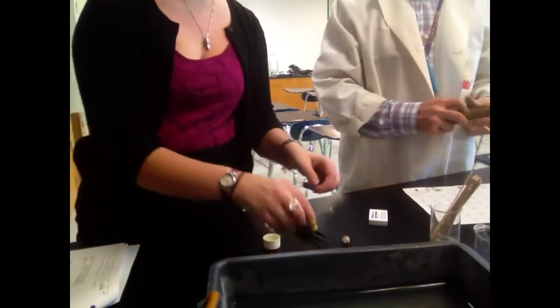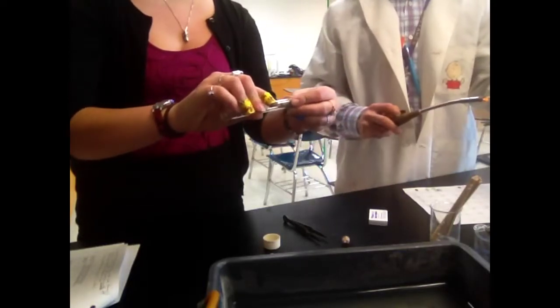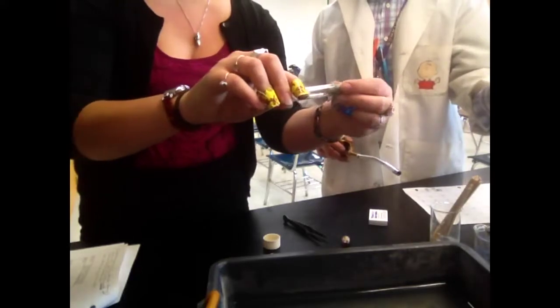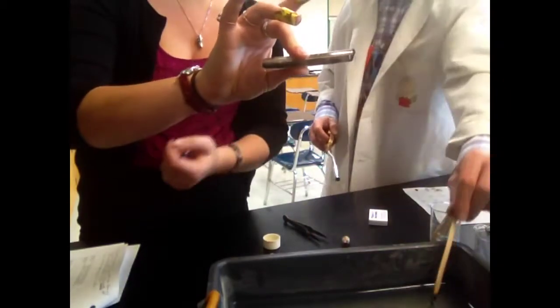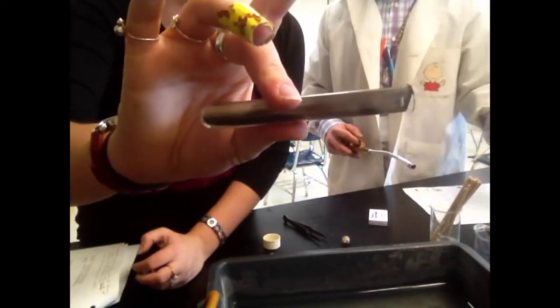Now with our half-filled acetylene test tube, I'm going to uncork it, put the flame next to it. Ooh. You saw that the flame spread through the test tube, and then the whole entire test tube became filled with soot.